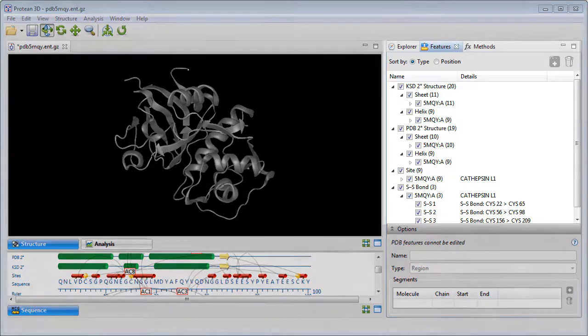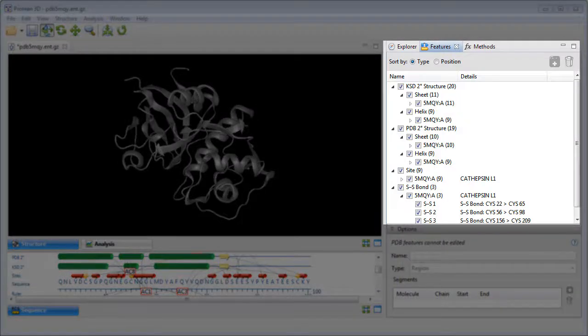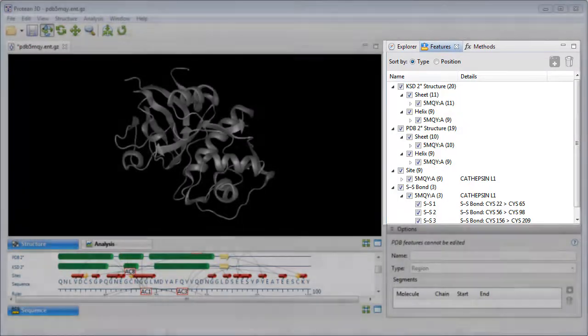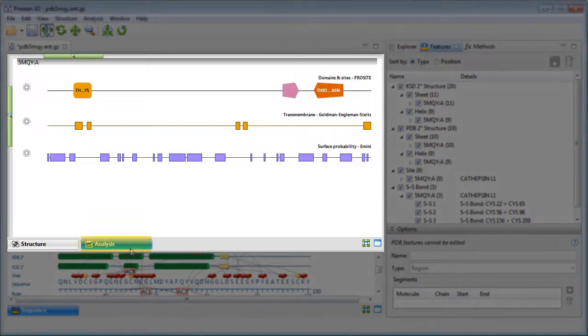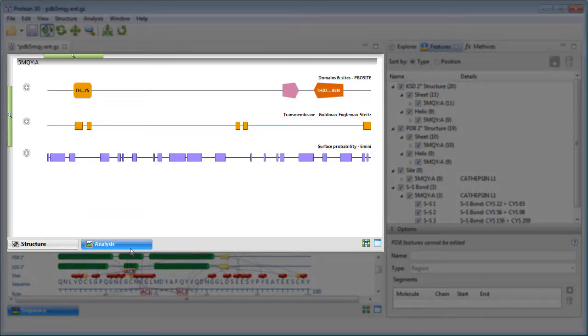The features that were imported along with the structure are displayed in the Features panel. Now we'll switch to the Analysis view, where I've already applied several methods of interest to the structure sequence.